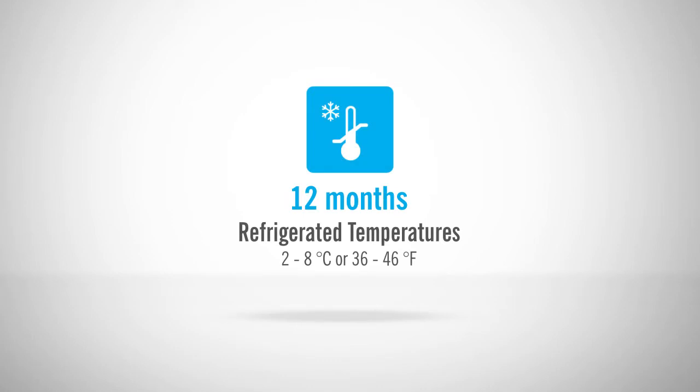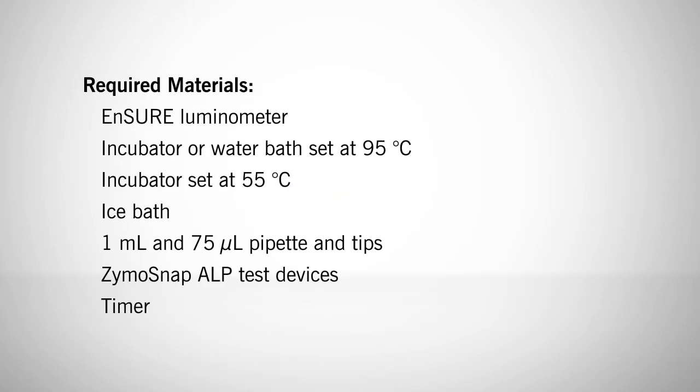Zymosnap ALP test devices and positive controls have a 12-month shelf life and should be kept in cold storage. The materials you will need include the Ensure Luminometer, a dry block incubator or water bath set at 95 degrees Celsius for preparation of negative control, an incubator set at 55 degrees Celsius for the test procedure, an ice bath, one milliliter and 75 microliter pipettes with tips, several Zymosnap ALP test devices, and a timer of your choice.